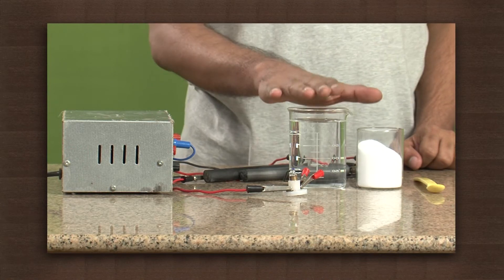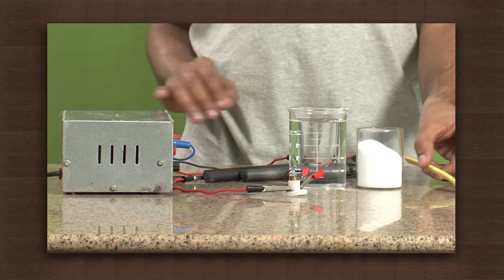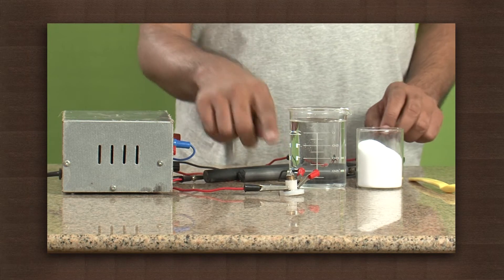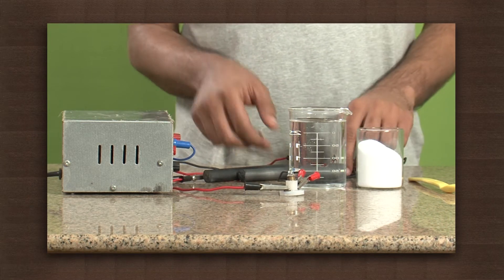For this we need beakers filled with distilled water, salt, a spoon, wires, a battery eliminator, a bulb with holder, and carbon electrodes.